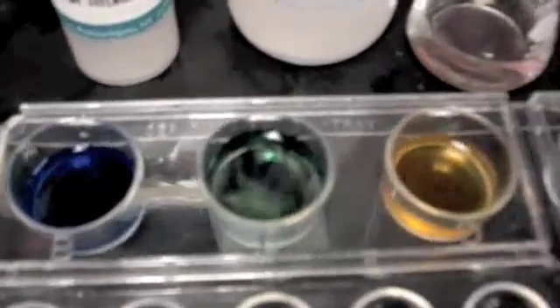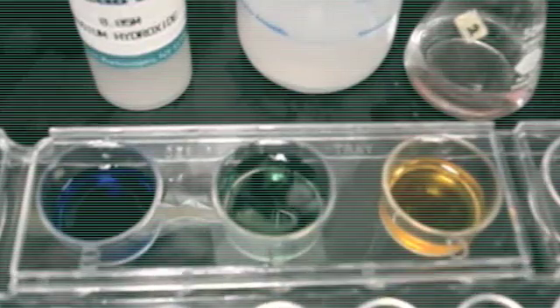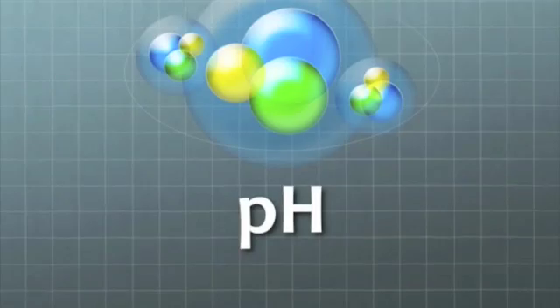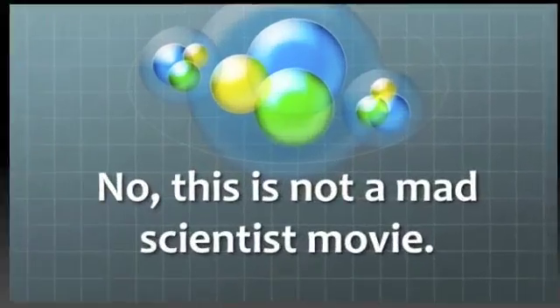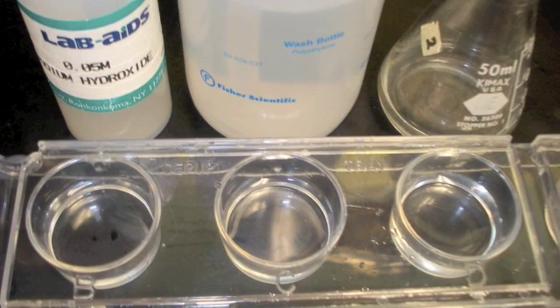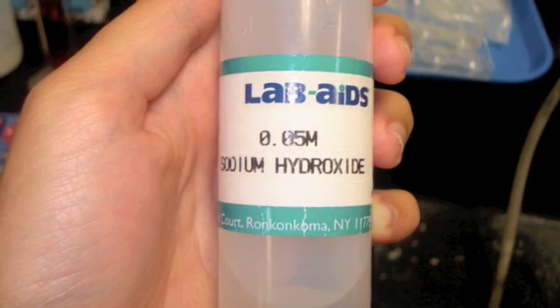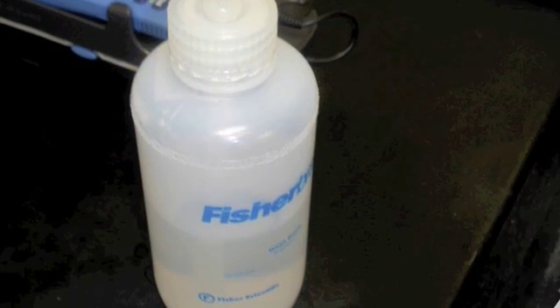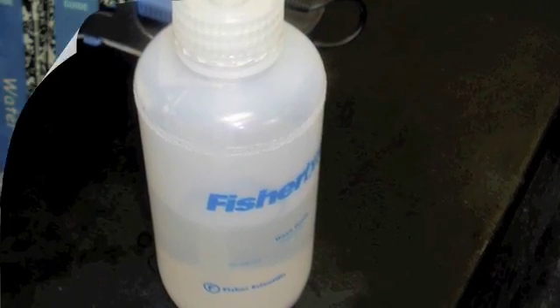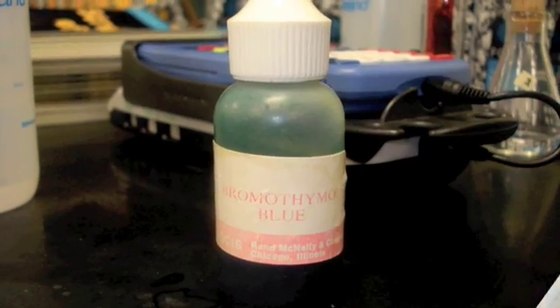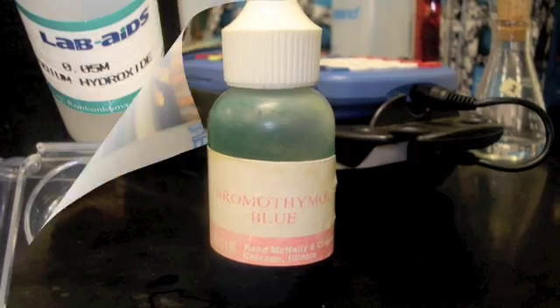In three separate cups were placed a few ml of 0.05 molar sodium hydroxide solution, distilled water, and 0.1 molar hydrochloric acid. One drop of bromothymol blue was then added to each liquid.